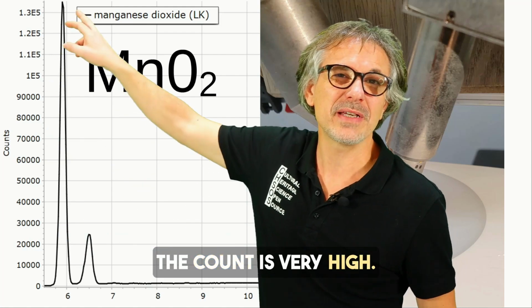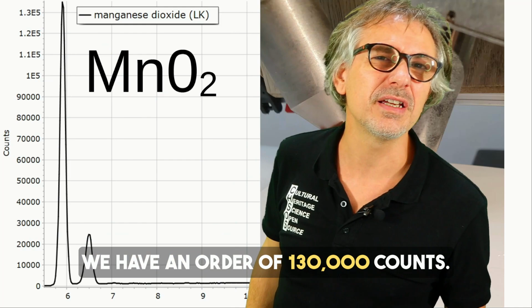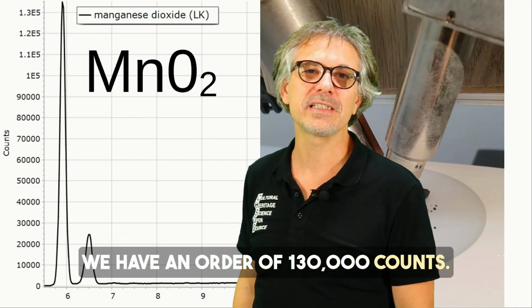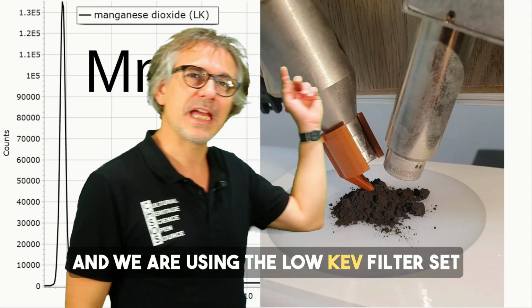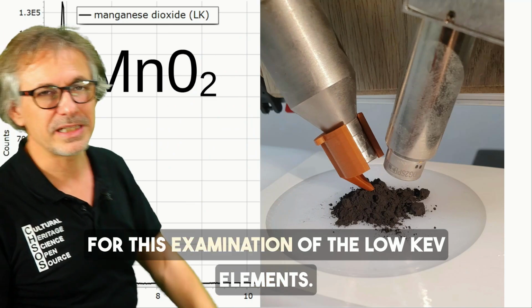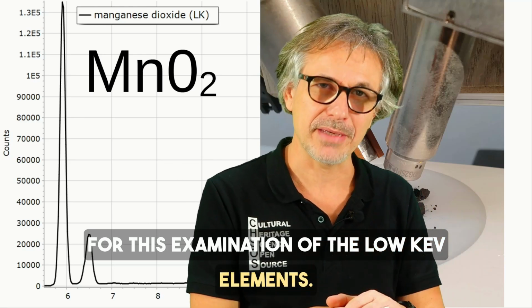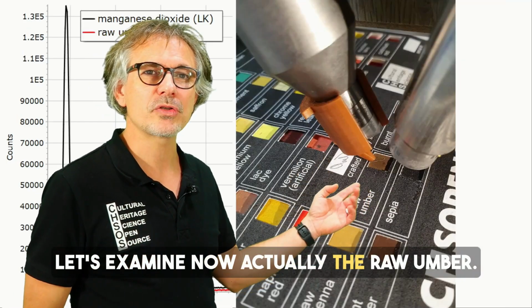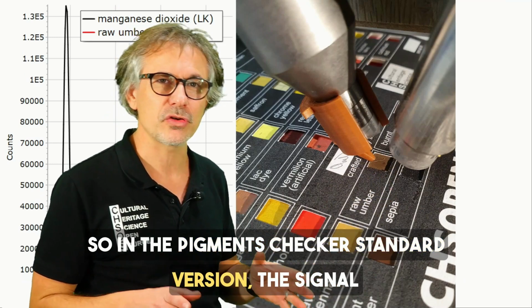The counts are very high, on the order of 130,000 counts, and we are using the low keV filter set for this examination of the low keV elements.